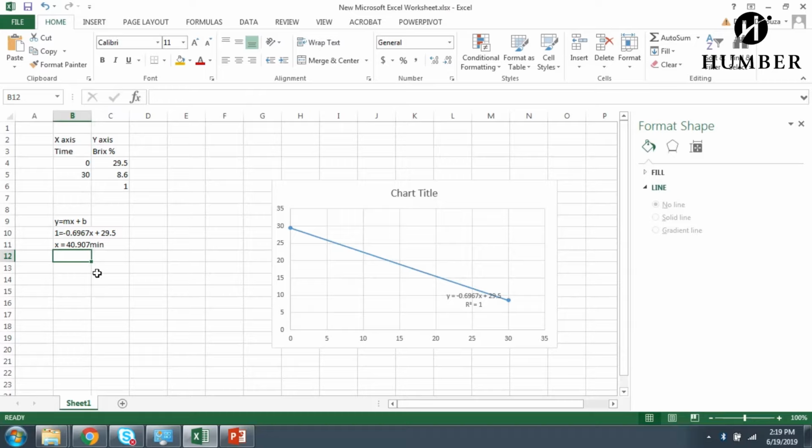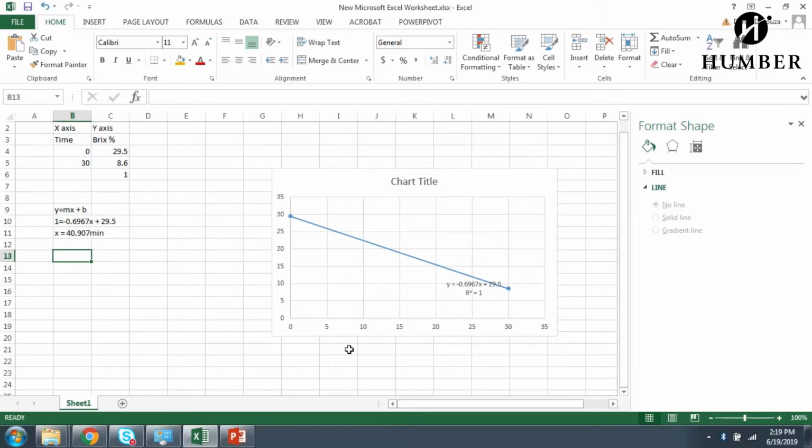Once again, this is an evaluated or extrapolated time, so it may not be absolutely accurate, but this is what we determined to be our equilibration, or the forced equilibration. I would think that now it makes it easier for you to do the same for the second solution which you would be doing. Thank you.